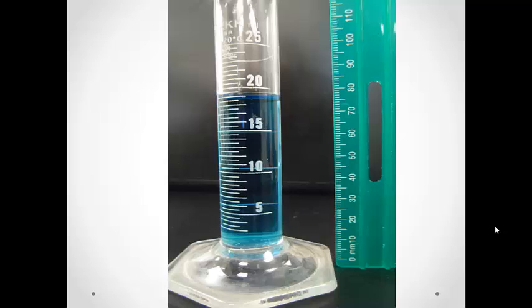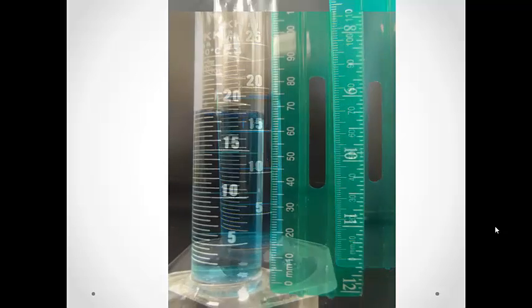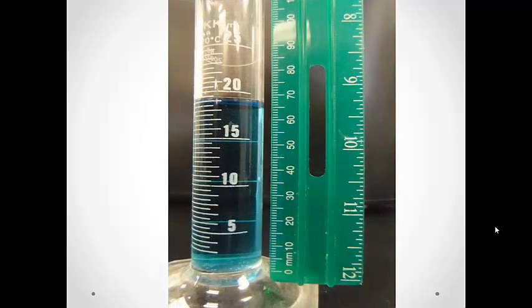Something else to be careful about is how you use the ruler. We only want to measure the height of the water column. Be sure to start at the bottom of the column of water, not the bottom of the cylinder. Also notice that zero on the ruler does not start at the end of the ruler. Precision is important.